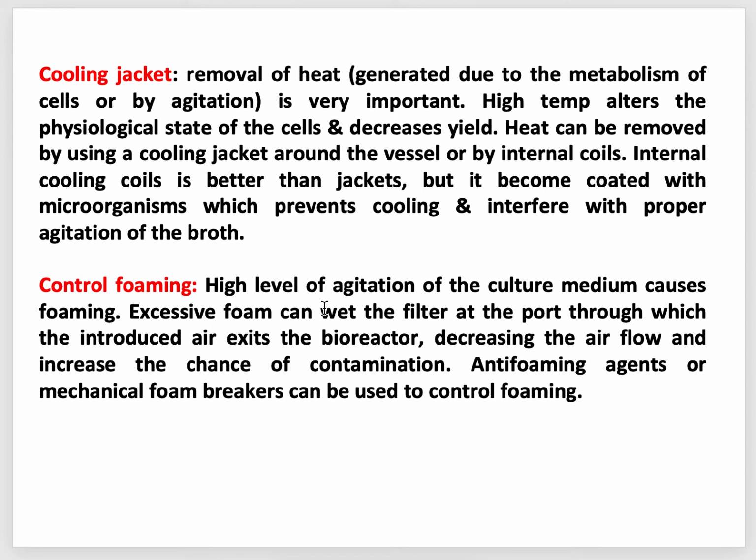If the filter is wet, the exit of the airflow will be hampered. That means the airflow exit will be decreased, and it will increase the chance of contamination. To control the foam, there are anti-foaming agents. So anti-foaming agents can be used, or mechanical foam breakers can be used. Anti-foaming agents are widely used.